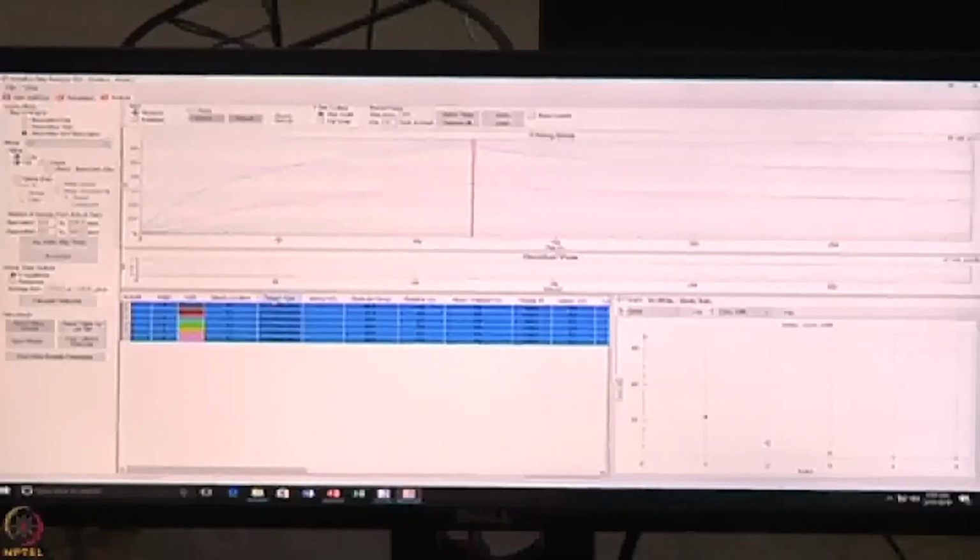If you know thoroughly, because when you are doing a publication, say suppose I got a 1:1 fitting data that was not giving a good fit, but you went for the 2:1 fitting model. Then you submitted a manuscript to some journal. Then the reviewer will ask you one question: you have mentioned the fitting 2:1 binding model, do you have any supporting data by any other technique that it is a 2:1 interaction? You have to provide. Generally, reviewer asks this question for any papers. So that's why we always try to fit for a 1:1 interaction.